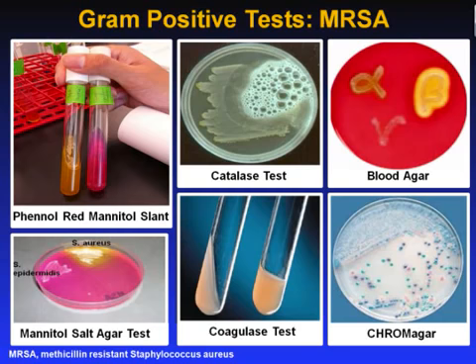Catalase is a common enzyme found in some organisms which functions to catalyze the decomposition of hydrogen peroxide to water and oxygen. The test is done by placing a drop of hydrogen peroxide on a microscope slide. Using an applicator stick, a scientist touches the colony and then smears a sample onto the hydrogen peroxide drop. If bubbles or froth forms, the organism is said to be catalase positive. Staphylococci and micrococci are catalase positive. If not, the organism is catalase negative. Streptococci and enterococci are catalase negative.